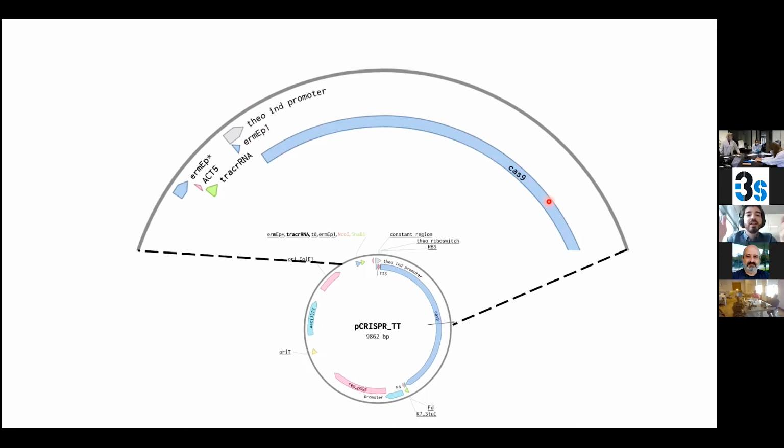Sorry, I don't know. No, they didn't. This was all performed here. Yes, Marta has some modifications in the plasmid. And this is the question. They all have this protocol. And this was, well, this is one of the challenges.